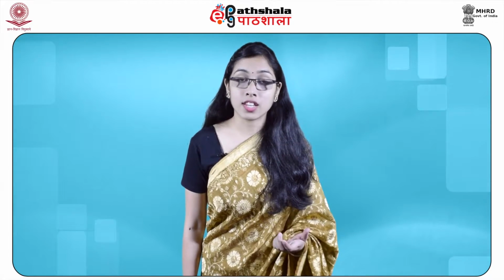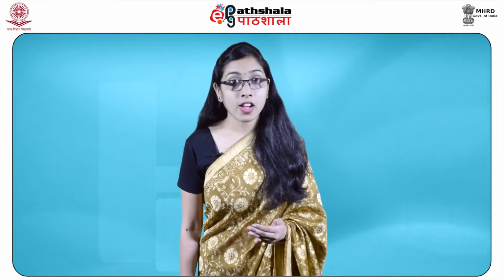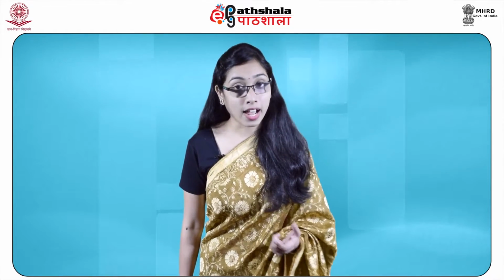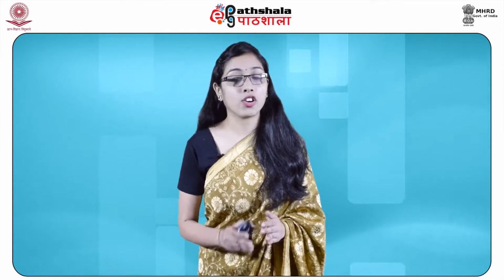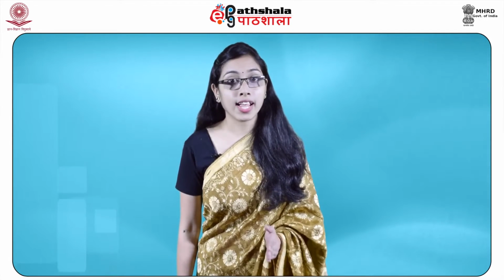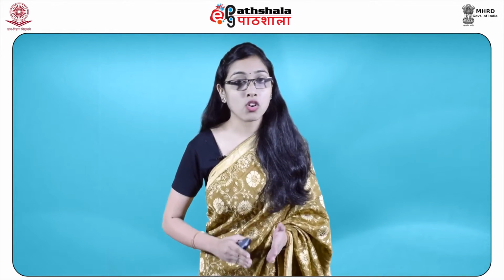This dendrimer is the focus of the chapter that follows here, on the nanocrystal composition for the detection of fingerprints. With a dendrimer concentration greater than 10 to the minus 4 molar, the solution was quite tacky and produced too much background via the indiscriminate adherence to the sample rather than the preferential adherence to the fingerprint on the sample. Thus, the dendrimer concentration employed ranged from 2 to 8 times 10 to the power minus 5 molar in methanol, as well as in the 1:9 methanol to water preparation.